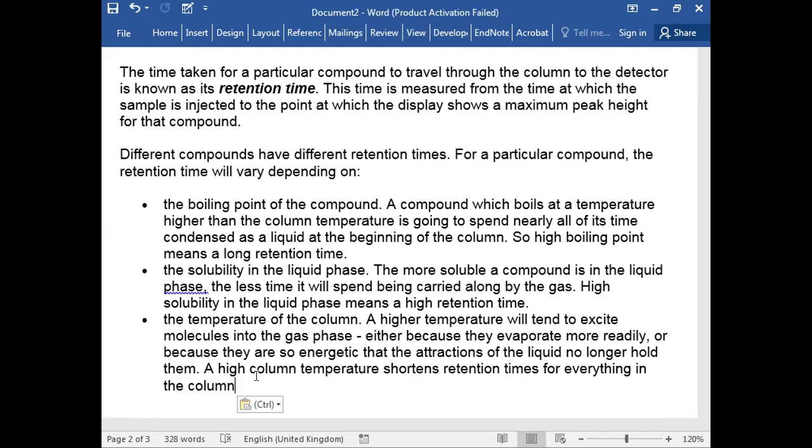Okay, so तीन चीज़ें हमारे पास होती हैं. Again, boiling point of the liquid: the more volatile it is, the lower the retention time, the more soluble it is on the stationary phase. And what will decide its solubility? The stationary phase is non-polar. So if you have a very polar component, it will not get stuck to the stationary phase. वो बड़ी आसानी से आपको मिल जाए.